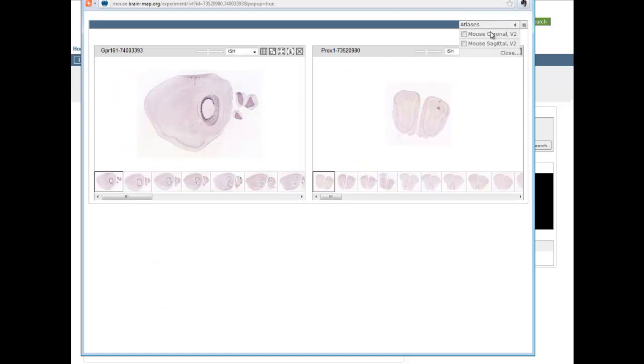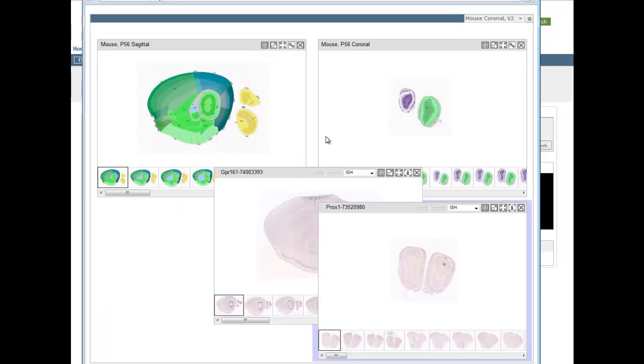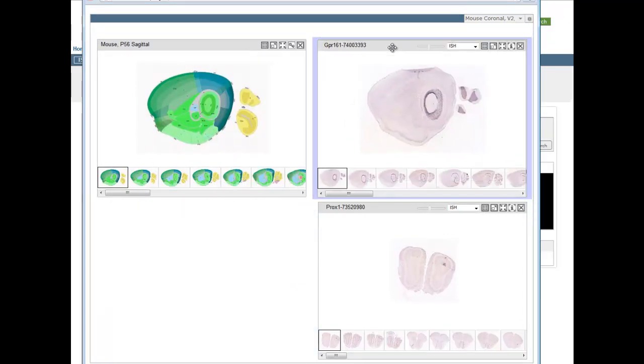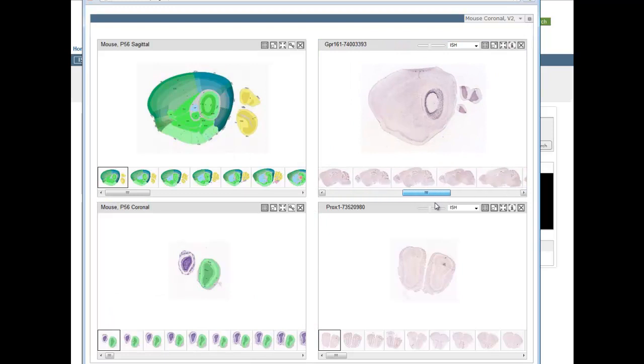In the window that opens, I recommend adding reference atlases to the selected genes, like so. You can customize your workspace by moving image viewers into more appropriate positions.